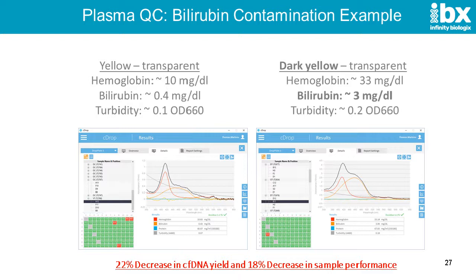the most complex sample. If the sample is degraded or further degraded, or if the yield of cell-free DNA is impacted, that ultimately can affect the complexity of the overall sample when we're looking at an entire free-floating genome, or a cancer genome, or a tumor genome, if you will, from free-floating DNA.